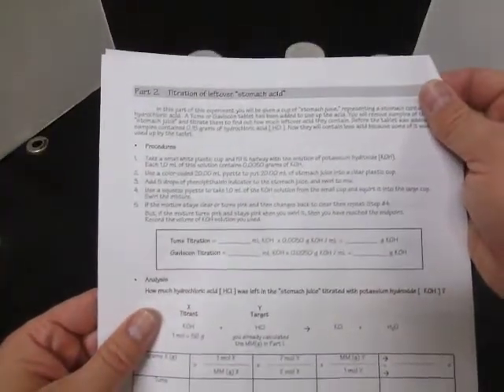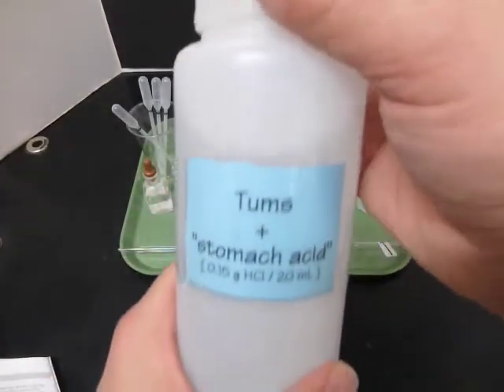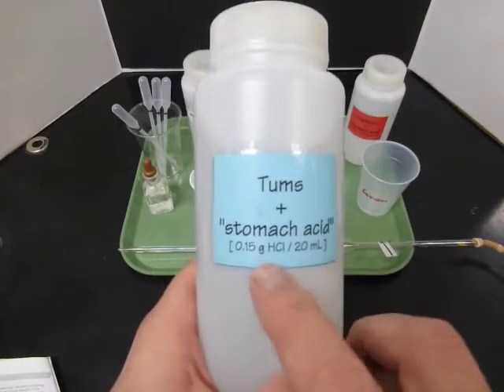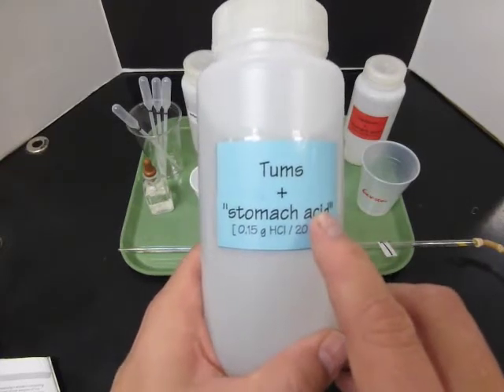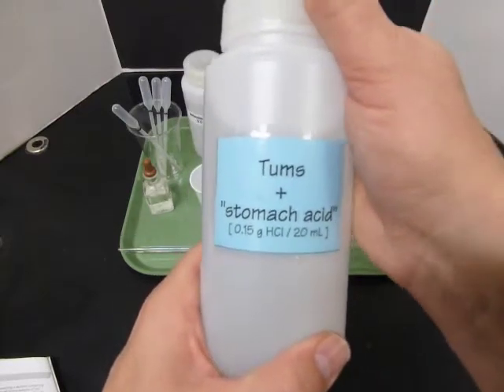Today what we're going to do is find out if that's really the case. So we're going to follow the procedures on part 2. Now, what I made up were some solutions of stomach acid, and I put some Tums in there. Each 20 milliliters of solution has 0.15 grams of hydrochloric acid, stomach acid, and then Tums were added to that solution to reduce the amount of the acid by however effective the Tums is.